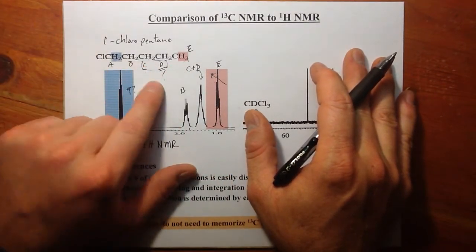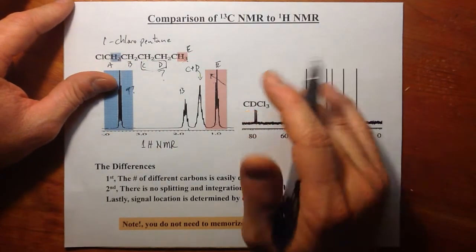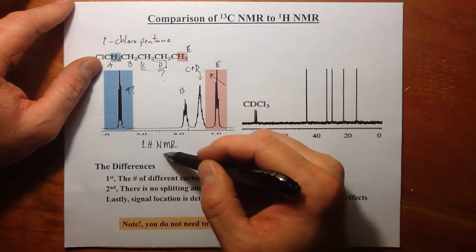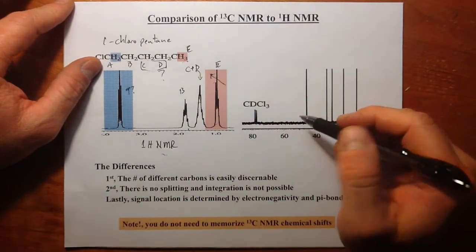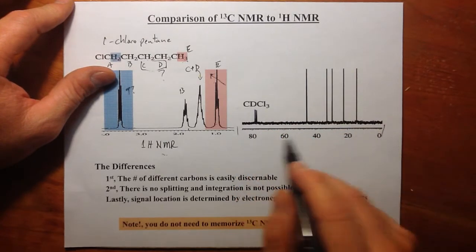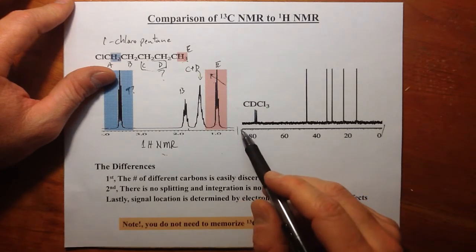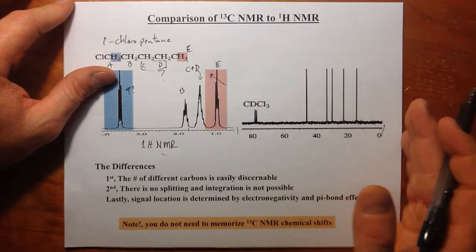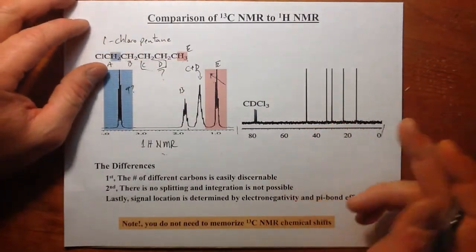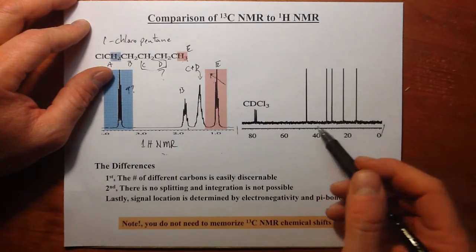Well, sometimes your molecules get bigger and it becomes harder and harder to resolve peaks if you have a very large structure, regardless of the strength of your magnet in proton NMR. But carbon runs on a much wider field, so you can have your signals stretch from 0 to anything up near 100 ppm. You can have your signals spread out, and if you decouple, meaning you don't look at splitting of carbons by other protons or carbons, we can have just nice singlets.